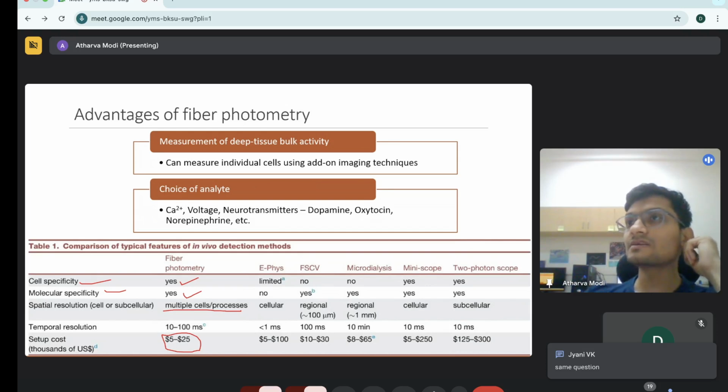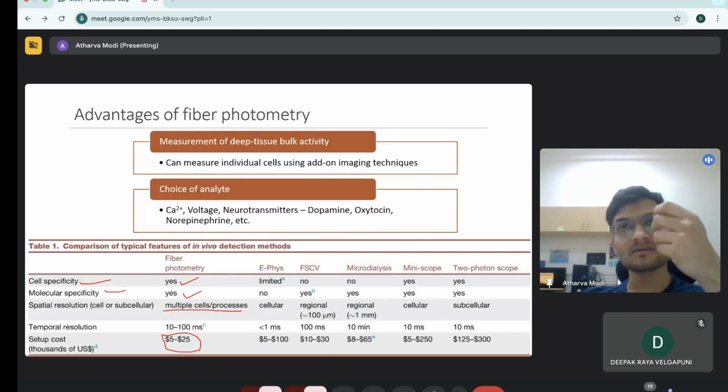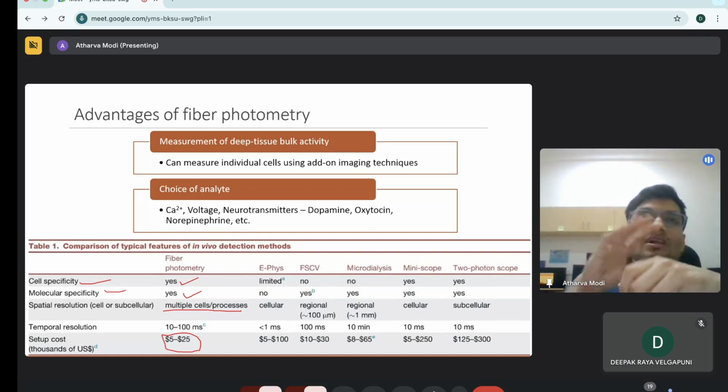Ligand binding to GPCR is essential for emission. What exactly triggered that binding that results in light emission, even during muscle movement, etc.? So the thing is that it may not be a signal from the biosensor itself. The movement may create artifacts in your optical fiber that create a false measurement.